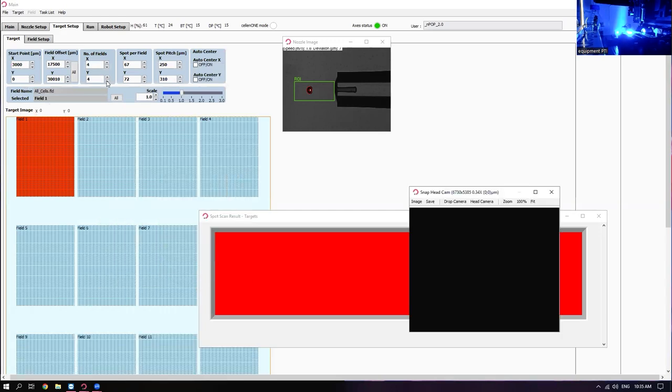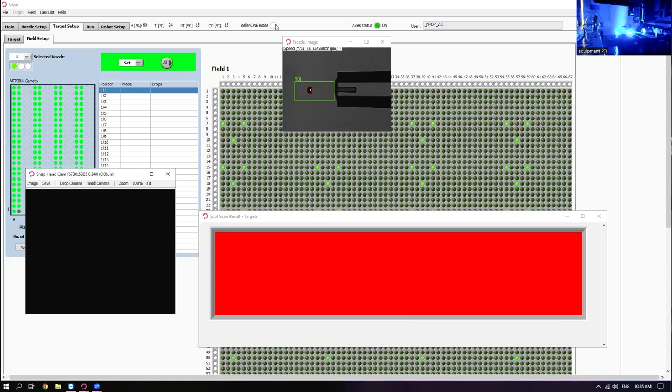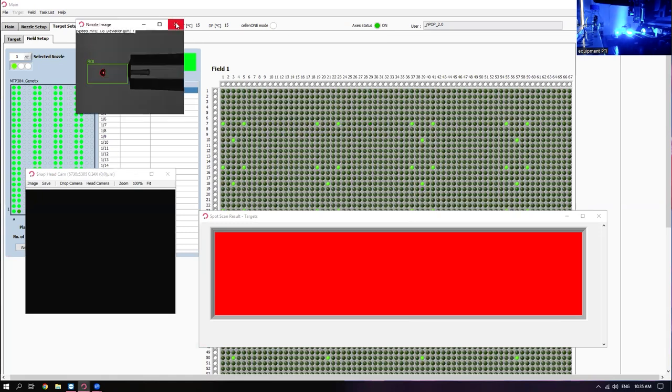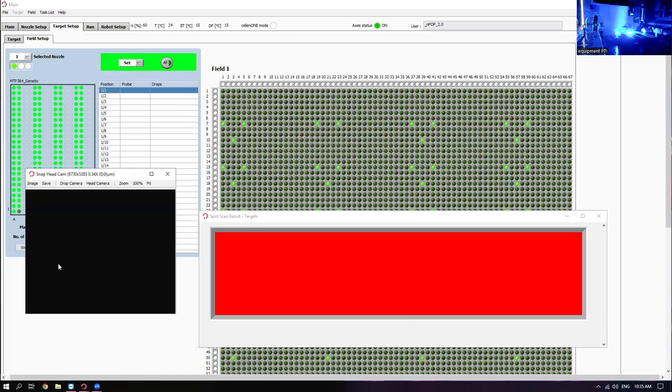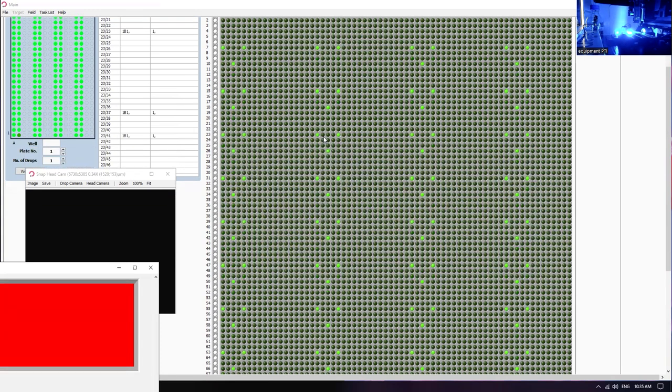Again, we select the number of slides we want to run. And we look in here, and we can see that we have our arrays. And every so often, we have a negative control in there. Those are true throughout the arrays so that you can go back and really see if you have sensitivity issues, or mass spec contamination in one of the channels or so.